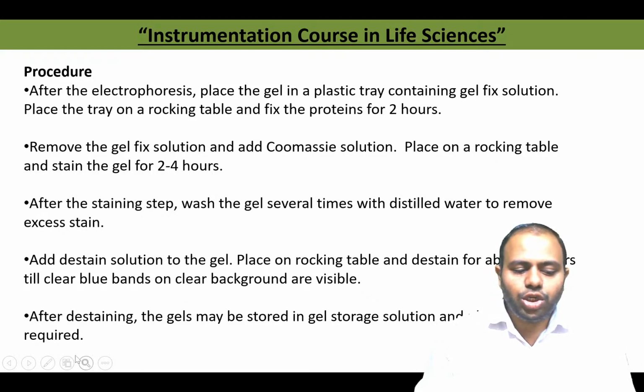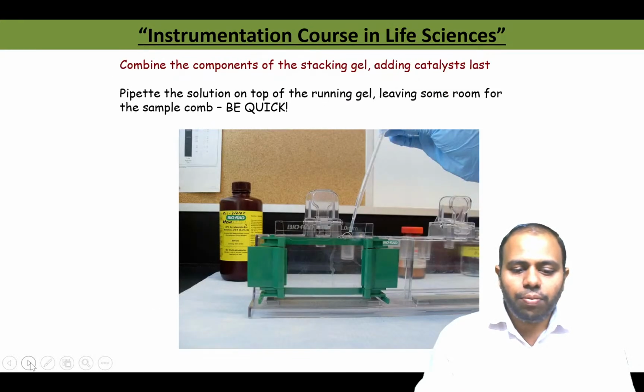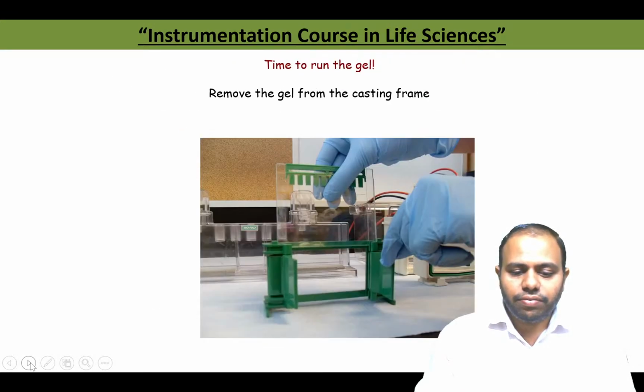Okay, so I will show you how the gel looks like after the protein bands are visible.